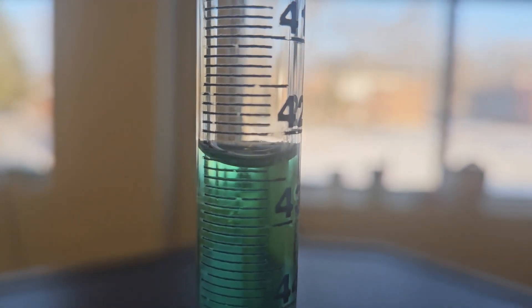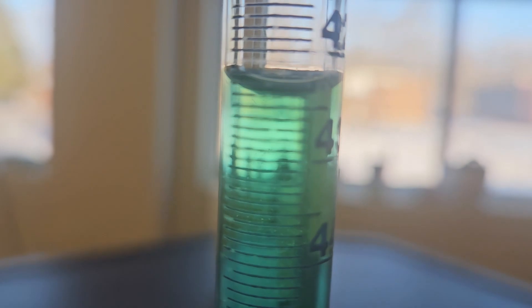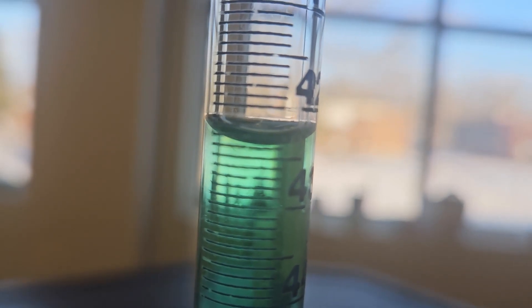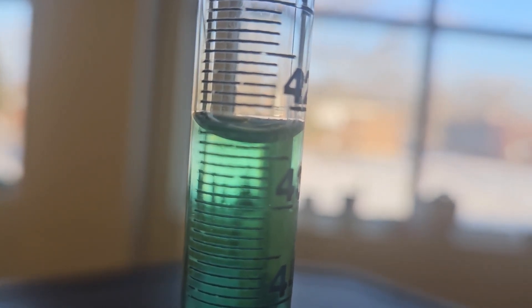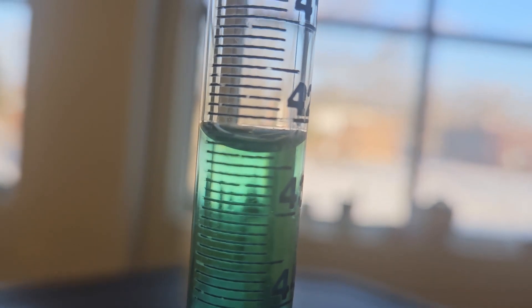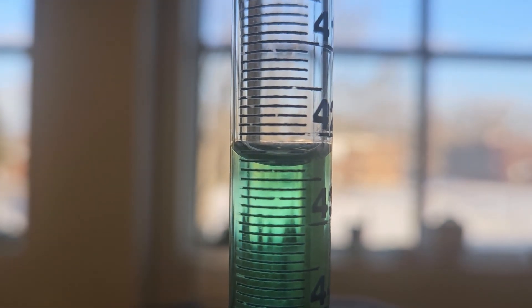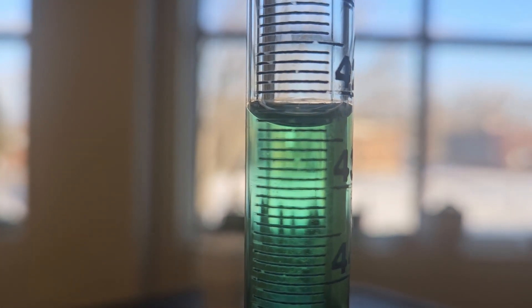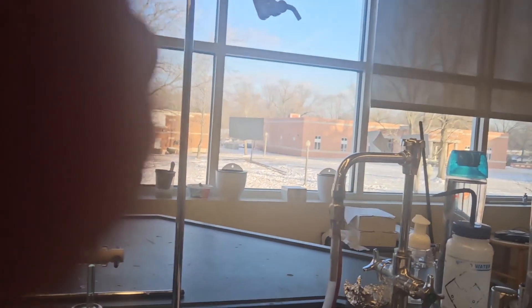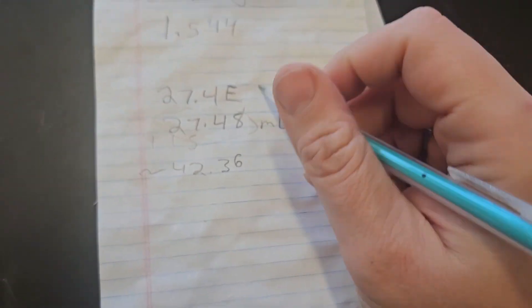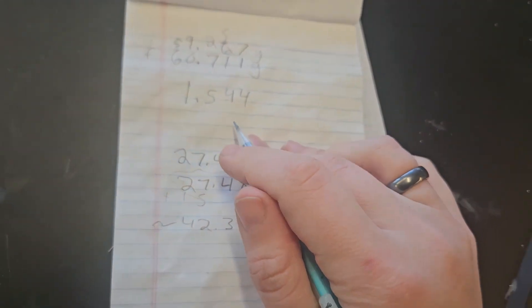Once again, that's 42, that's 42.5, that's 42.4, and that's 42.3. The meniscus is right at, I'd say 42.36. So I went to 42.36. So now the last thing I need you to do before you dispose of this is to do a quick calculation.